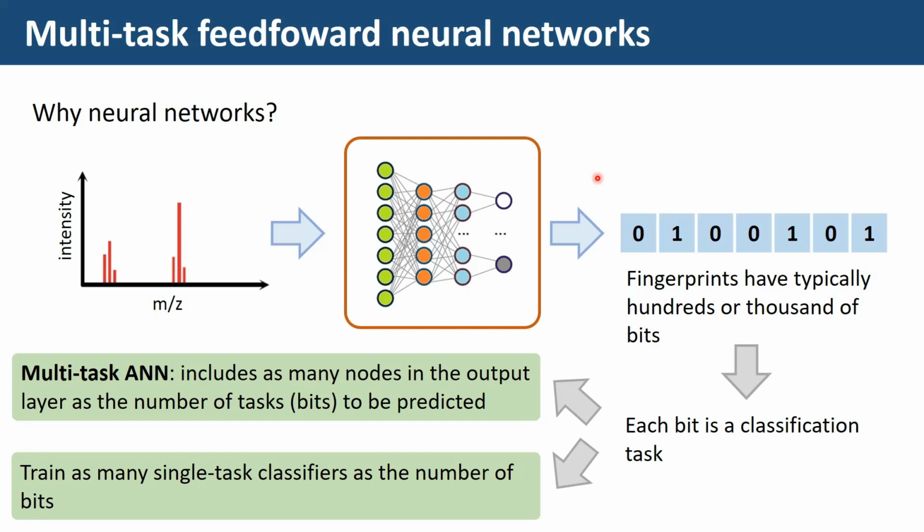Then, do you think you could get better prediction for simpler molecules if you reward the ANN for predicting zeros correctly? What other molecular representation would you recommend to try? A molecule is a graph. Could it make sense to train a sequence predictor like an LSTM network used in machine translation to avoid the problem with fingerprints not representing enough of a molecule?